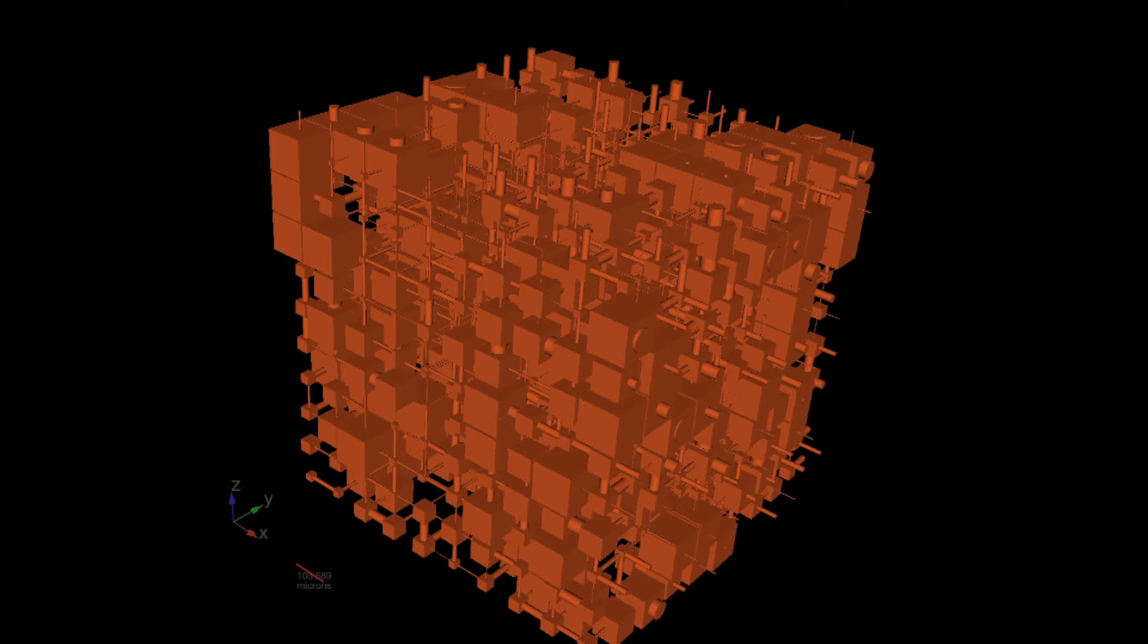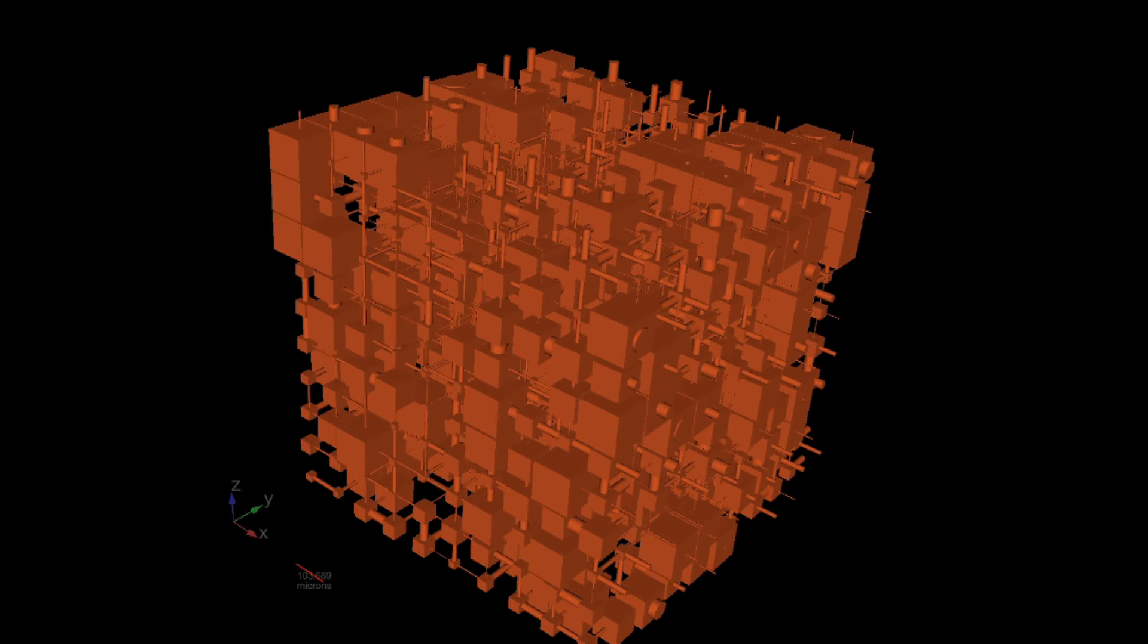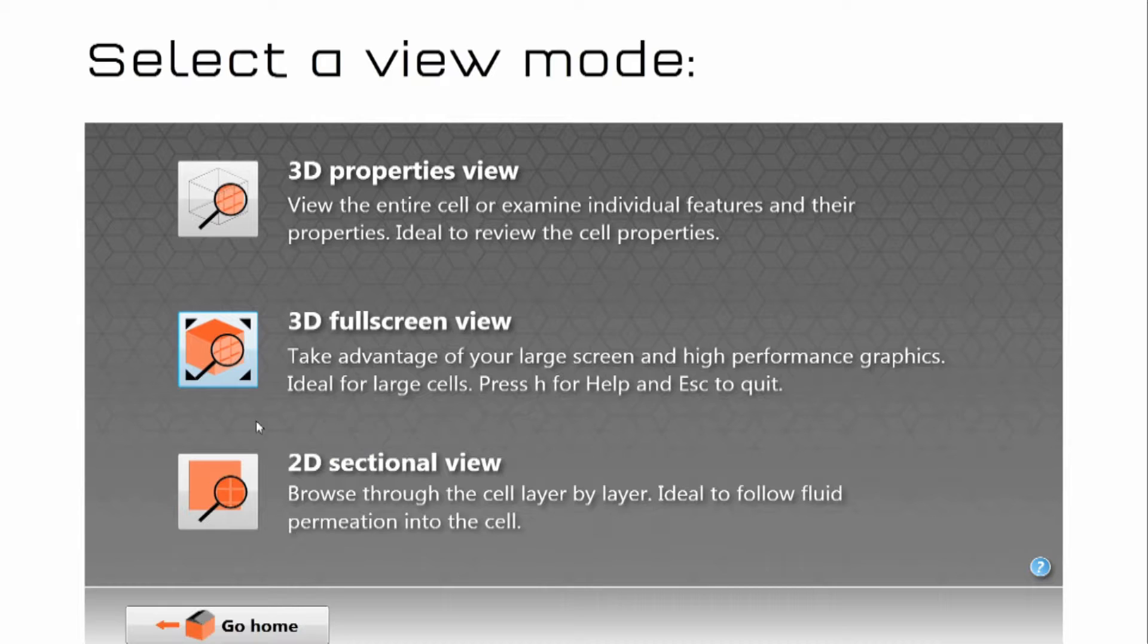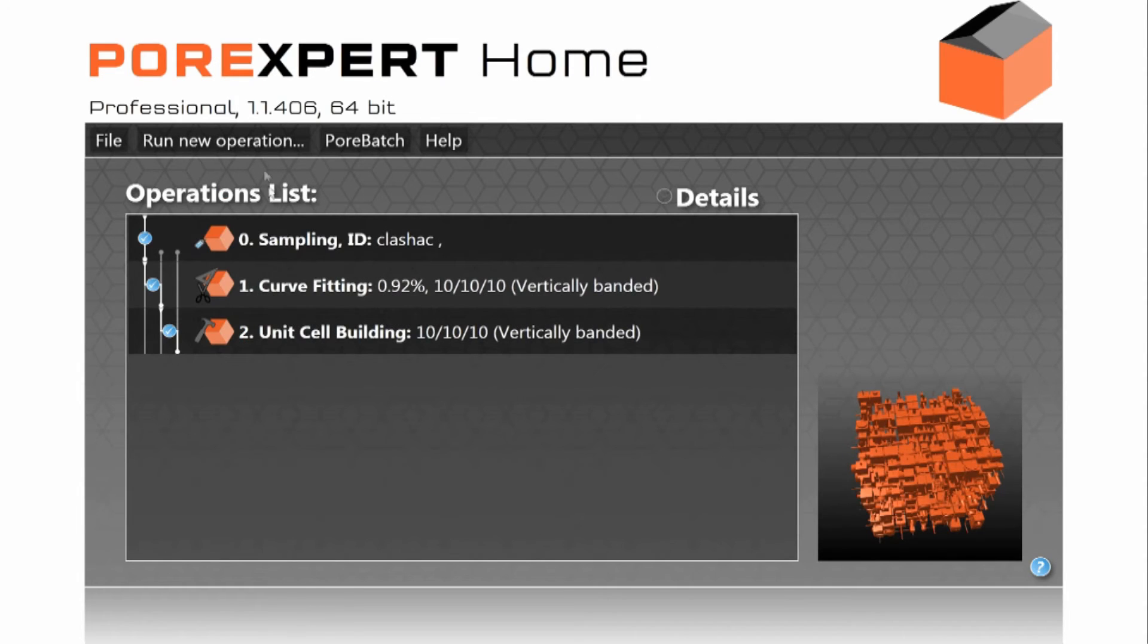But the important thing is that if you put this simulated structure for example into a mercury porosimeter it will give you exactly the same experimental results as your own sample. So we escape from that and go back to the home screen.